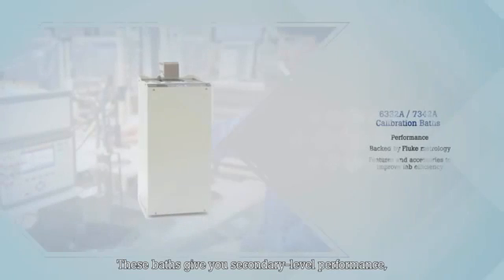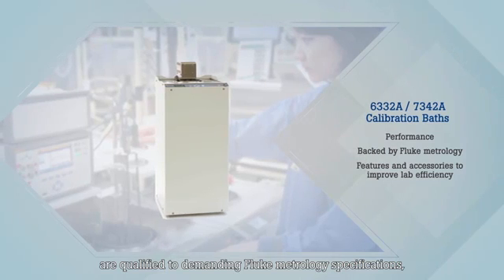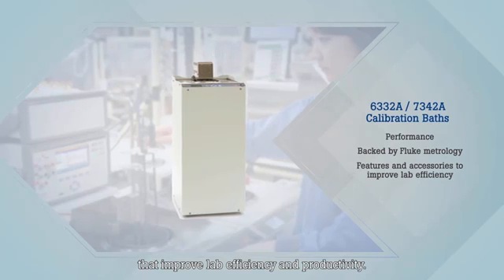These baths give you secondary level performance, are qualified to demanding Fluke Metrology specifications, and offer many features and accessories that improve lab efficiency and productivity.